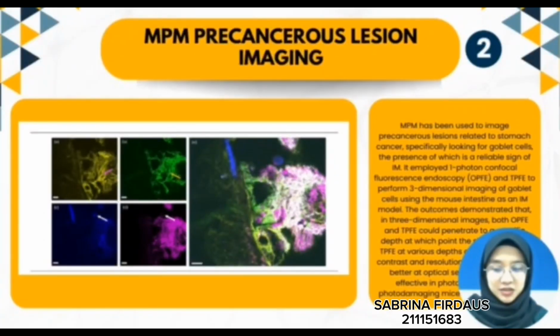Hi, I'm Firdaus and I'll be continuing with MPM precancerous lesion imaging. It has been used to image precancerous lesions related to stomach cancer, specifically looking for goblet cells, the presence of which is a reliable sign of IM.